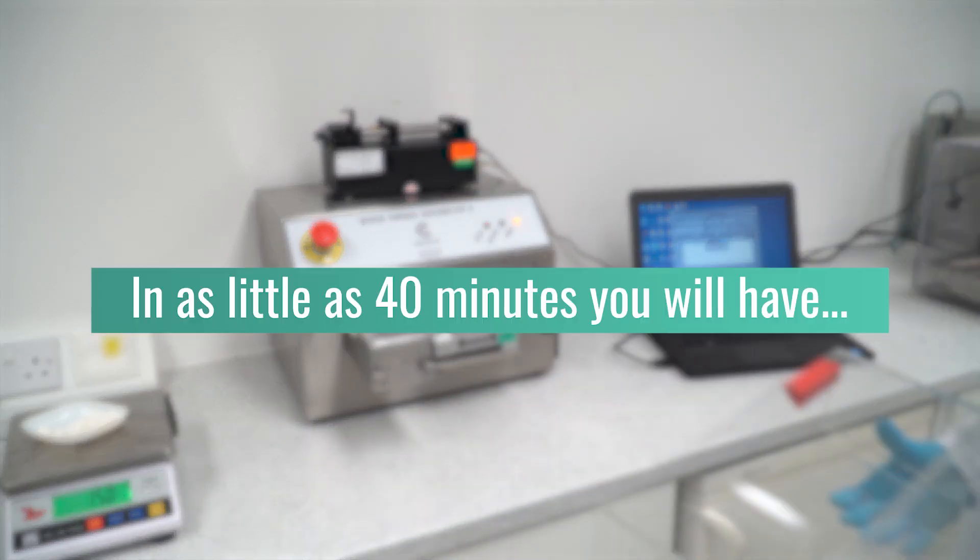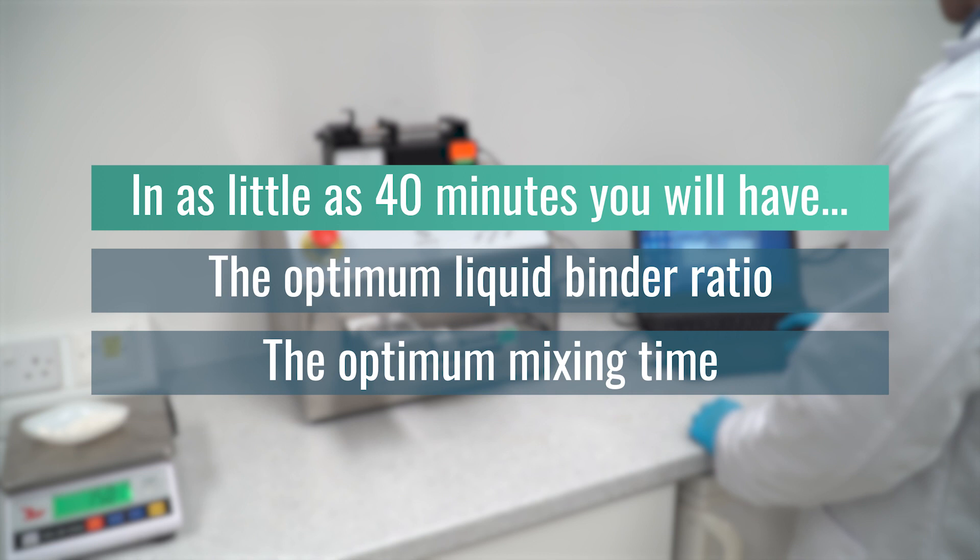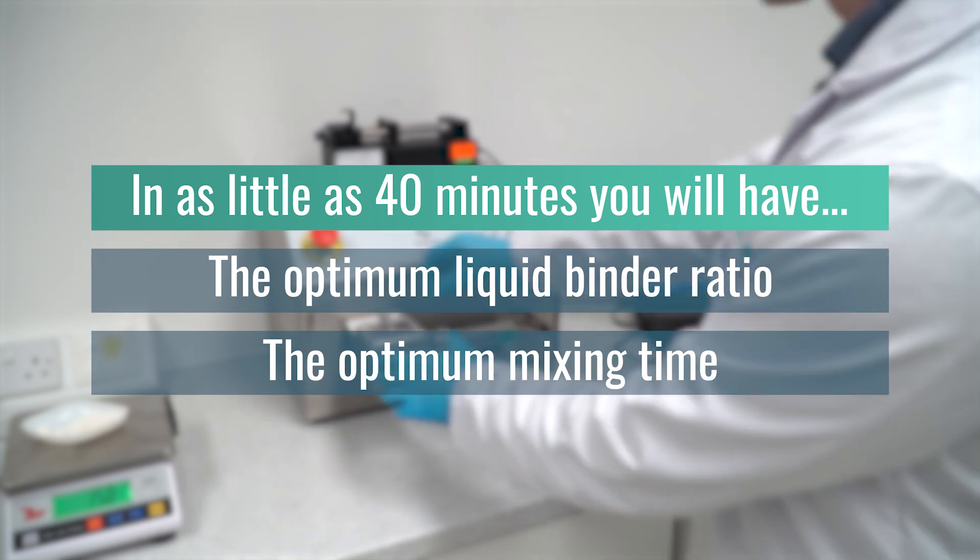In as little as 40 minutes, you can determine both the optimum amount of liquid binder and the ideal mix time for your formulation to create a homogeneous result with the highest chance of development success.